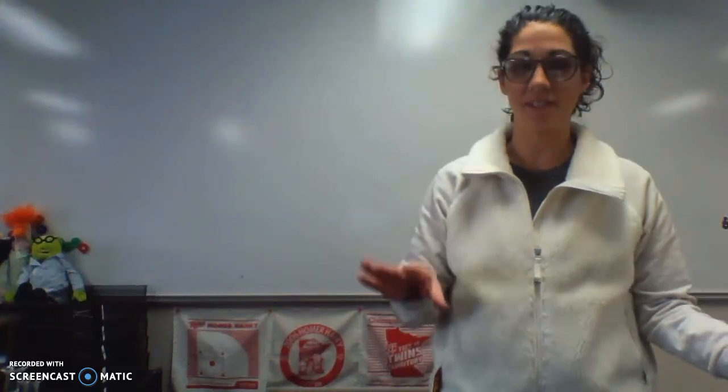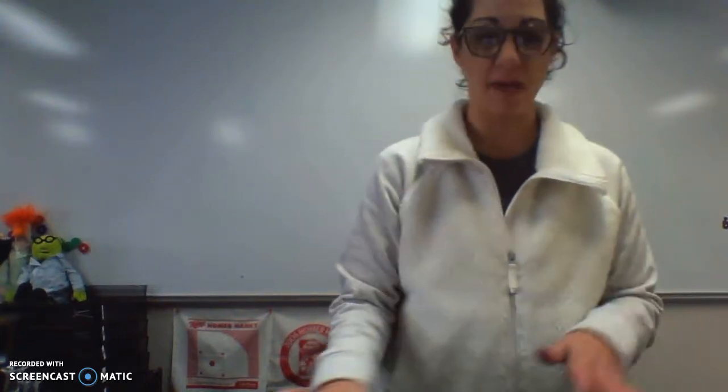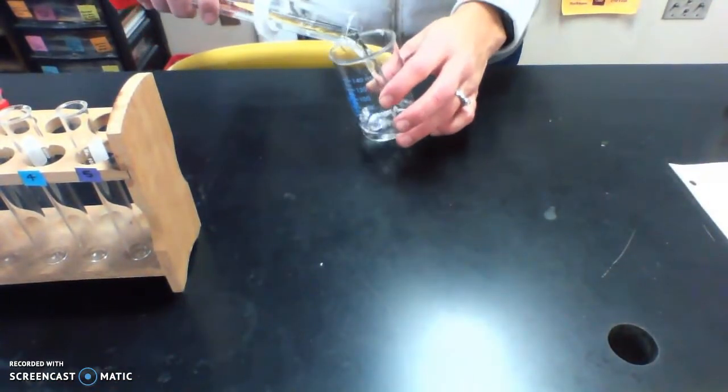So this is part C for the Le Chatelier's principle experiment. In this one, we have to first make our solution. Let me shift some stuff here. All right, so I'm gonna add to my beaker 50 milliliters of distilled water.